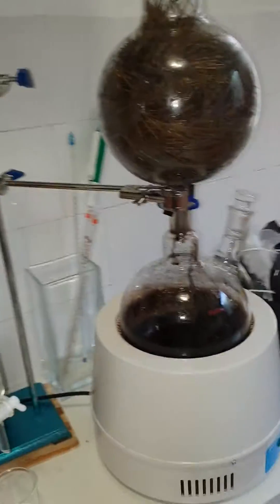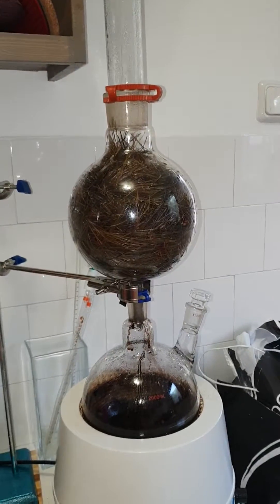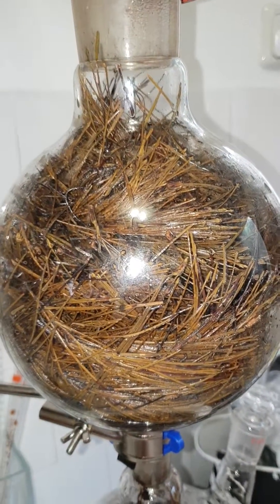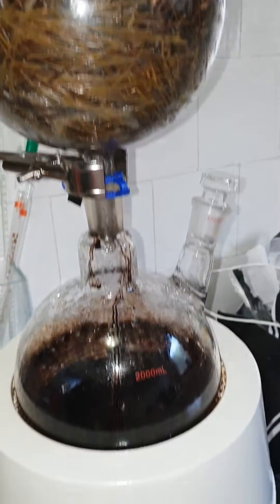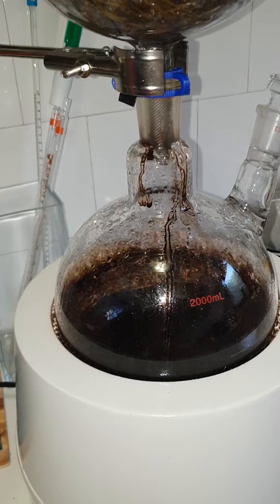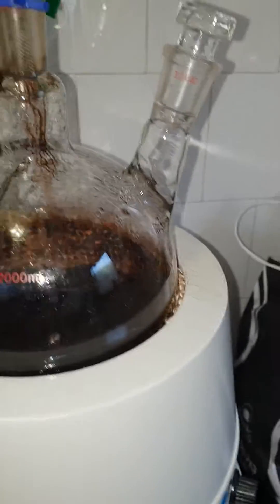After about two hours of steam distilling, this is how the pine needles look. We had a little incident — I forgot it on while working on other stuff, it dried out, and eventually it cracked, so I'll have to buy a new one.